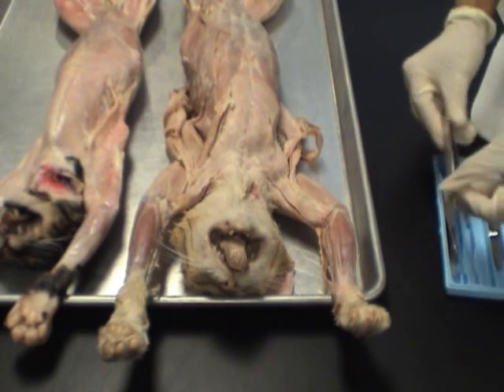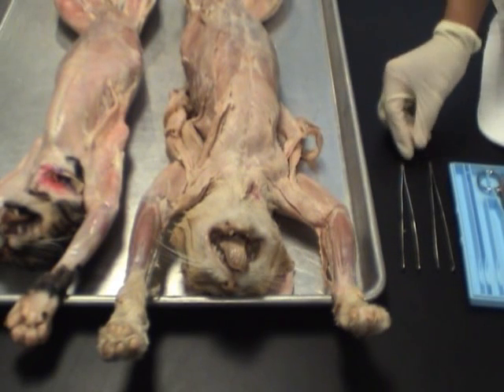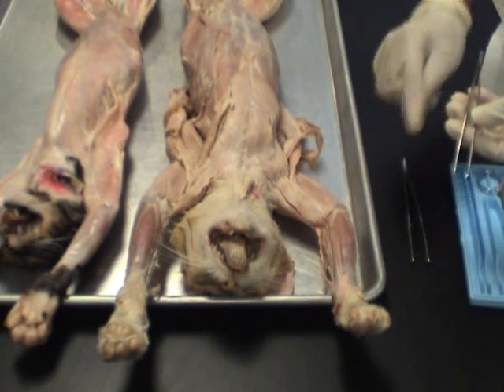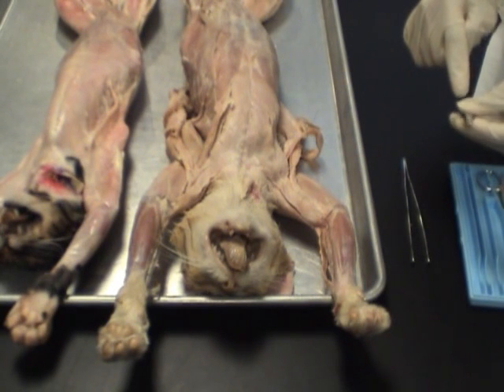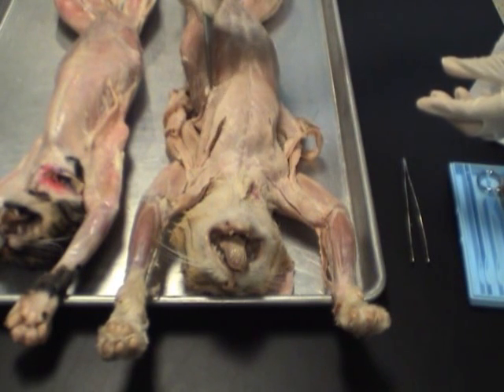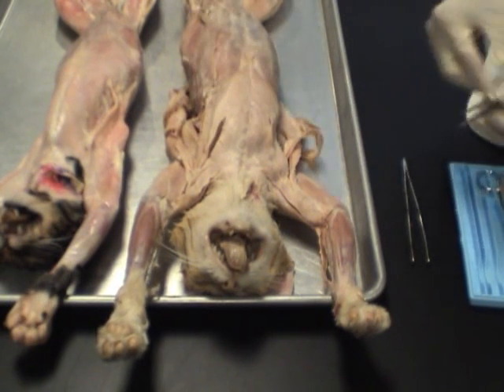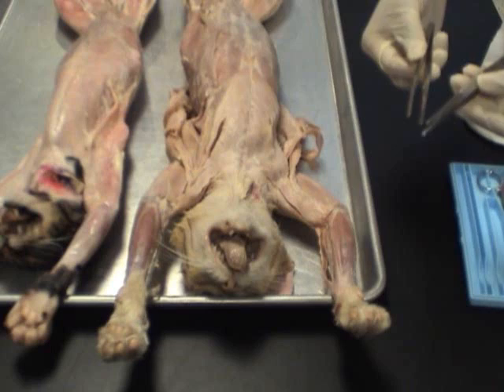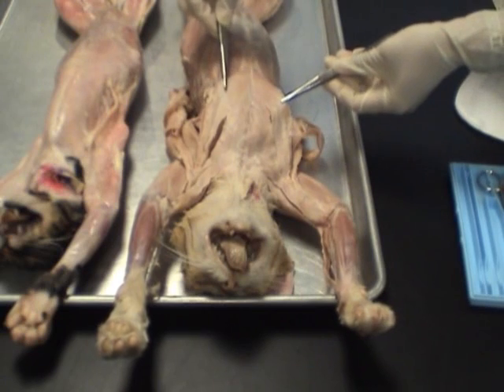We have this kind of tweezers, and we have this other one. What's the difference? Well, basically the ends. If you look closely here, the ends on this have little pointy, triangular shaped points so that you can grasp things easier. For example, the pointy thing makes it easier to hold whatever it is that you're trying to hold. The other tweezer does not have that. It is more of a flat shaped head. So it does its job pretty well, but it depends on what type you want. You can use either one.